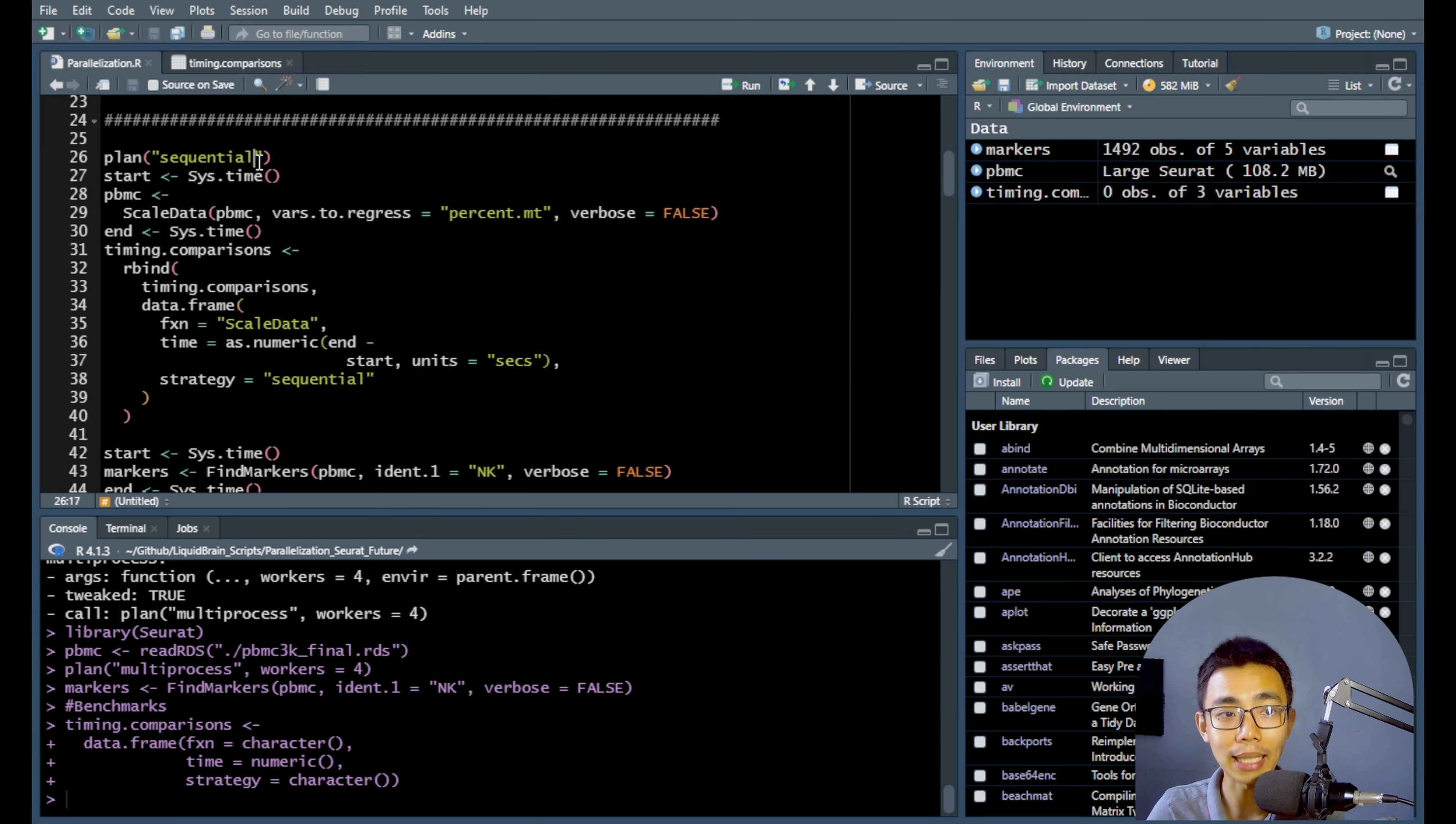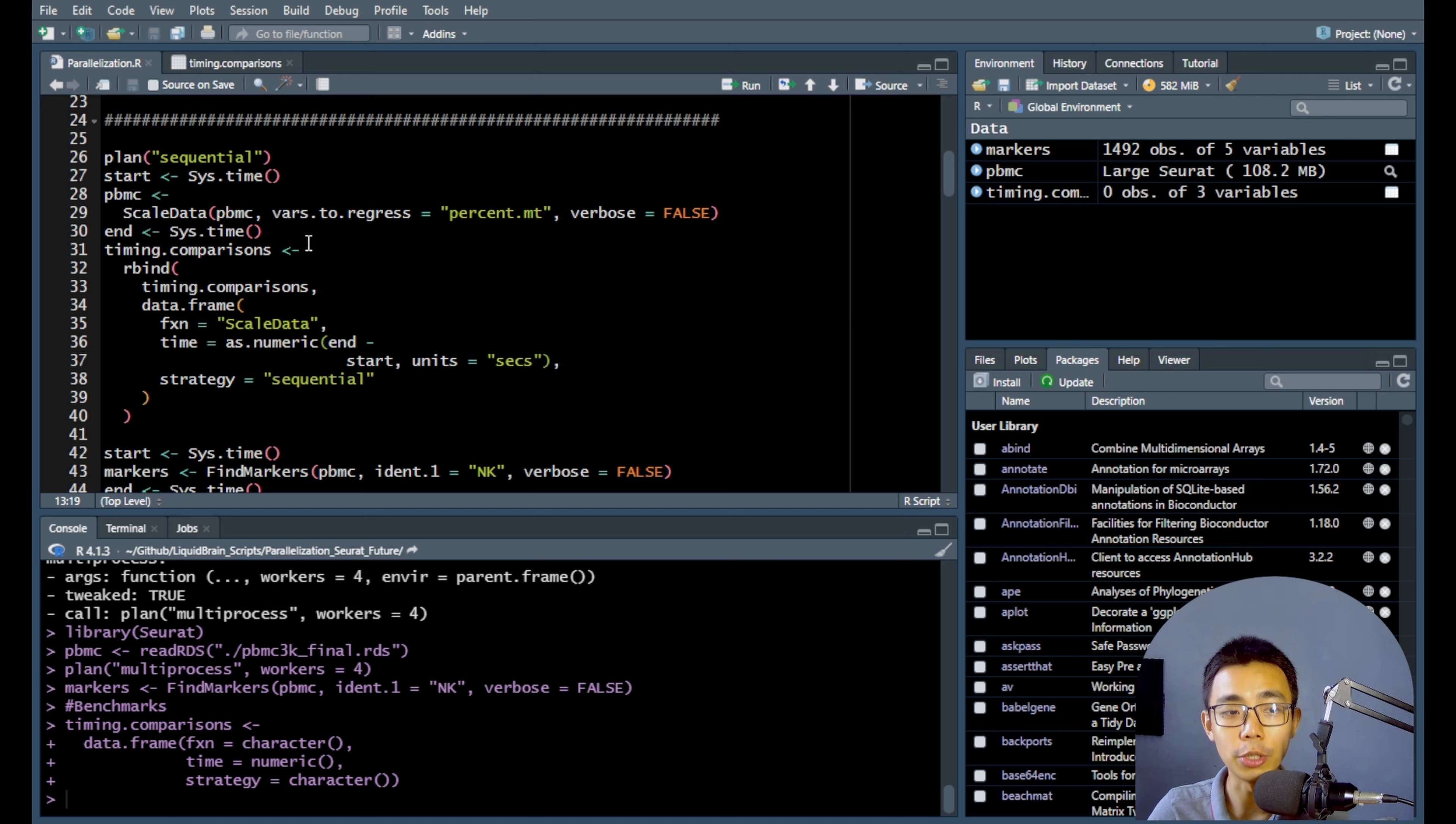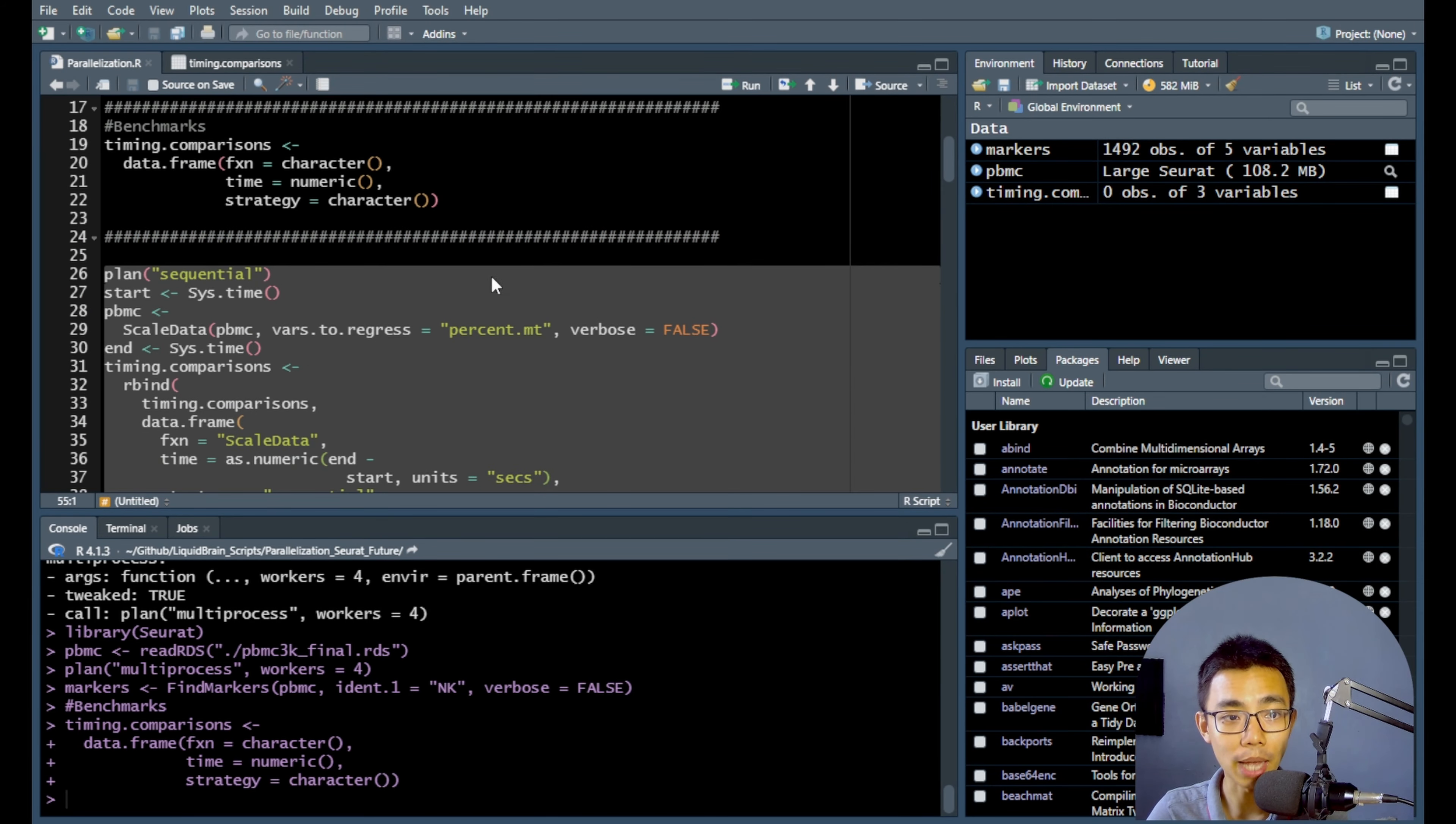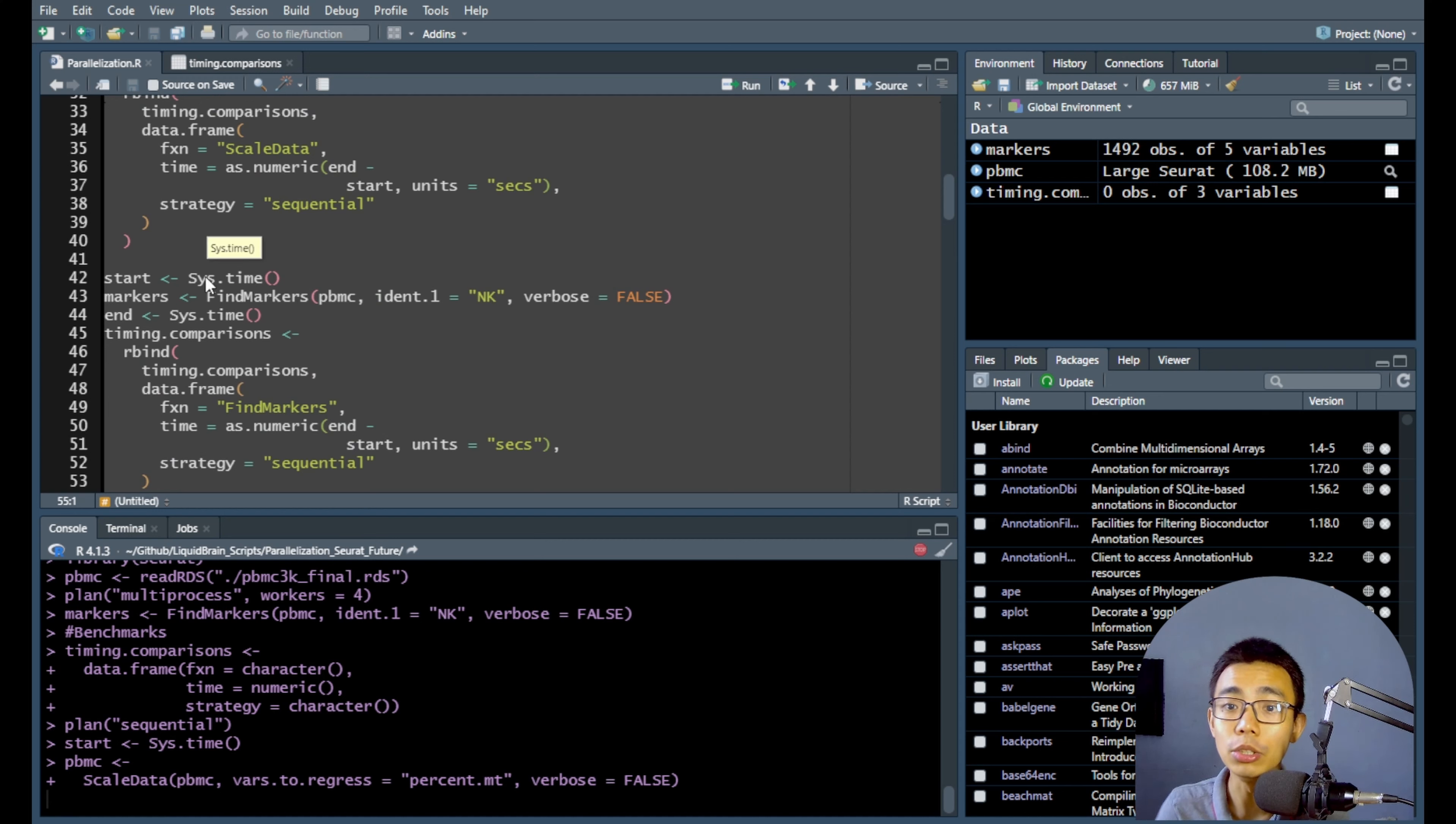So that is what it is trying to do. So you can see there's a plan sequential here, which is a different thing from the multi-process that we have just now. So when it's sequential, means it's actually just a single thread operation, right? One after another. That's what we call sequential. So what you do is you can just highlight the whole thing and just press run. So that will actually run the sequential for both scale data as well as the find markers and actually pipe the data into the timing comparison data frame.